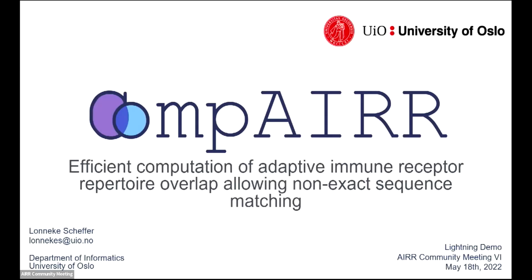Hello, everyone. As Justin said, my name is Lonneke Scheffer. I'm a PhD student at the University of Oslo, and I'm presenting CompAIRR, which is a tool for efficient computation of overlap between immune repertoires and also allowing non-exact sequence matching.